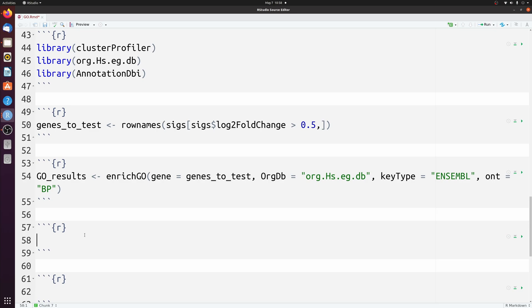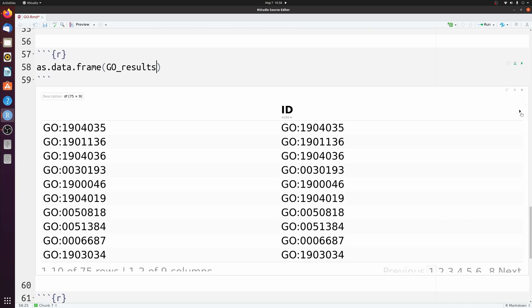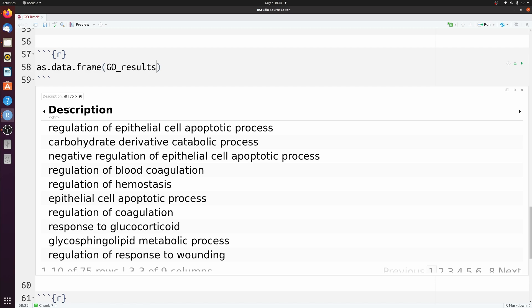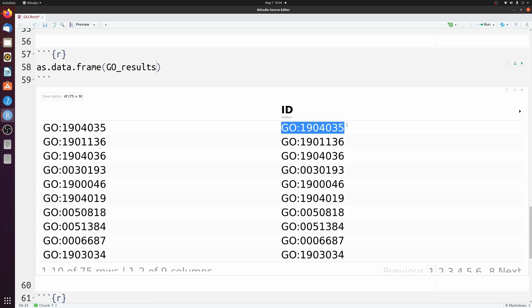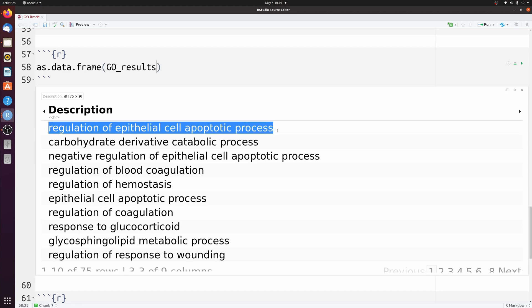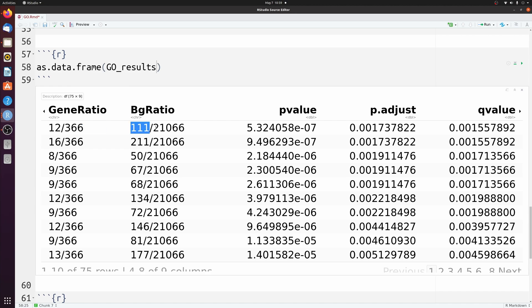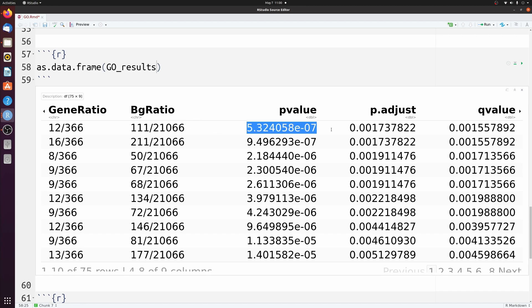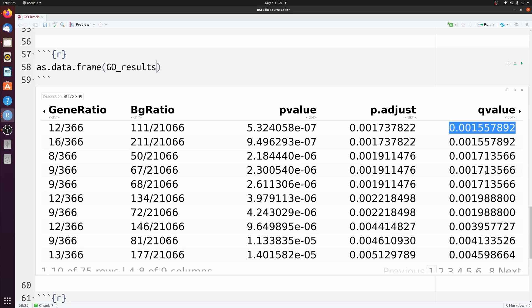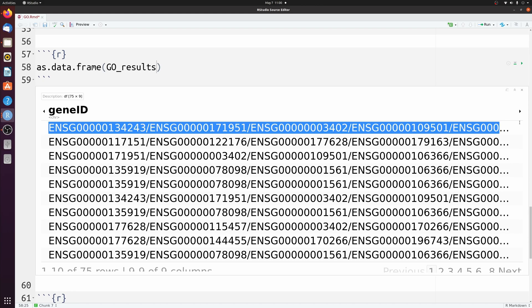Let's look at the results — we can convert it to a data frame. You have the GO ID, the description, and then how many genes out of your input genes were in that GO term. You have background ratio, which is the number of genes in the GO term versus the total number of background genes — how many human genes in total were used. Then you have the p-value, the adjusted p-value, another adjustment method, and all the gene IDs found from your data.